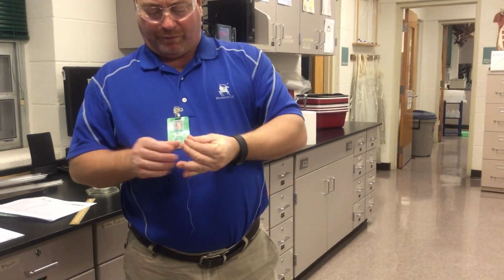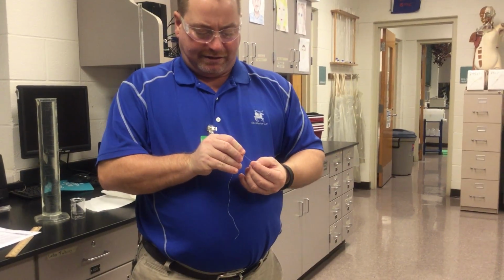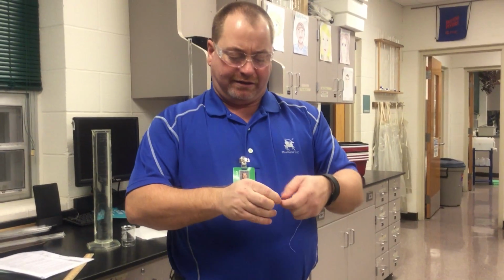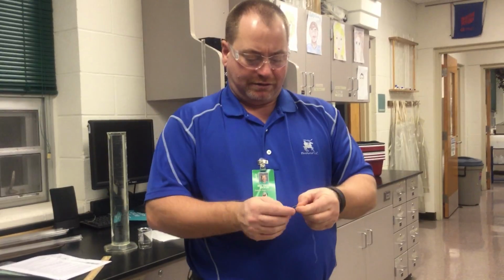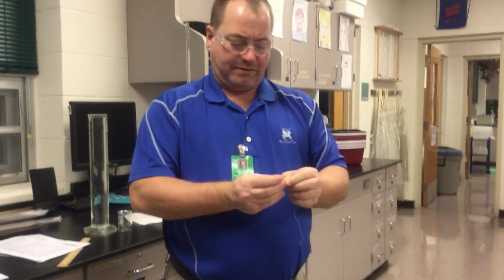It's going to be kind of hard to see. Get that in there, Kyle. It's just a little tiny piece of magnesium I coiled up. And here's the hard part, tying this onto the magnesium. It would be a little bit tougher, but I'm kind of used to tying fishing line, so I know how I would do the fishing line, so that's how I'm going to do my tied up magnesium, maybe.